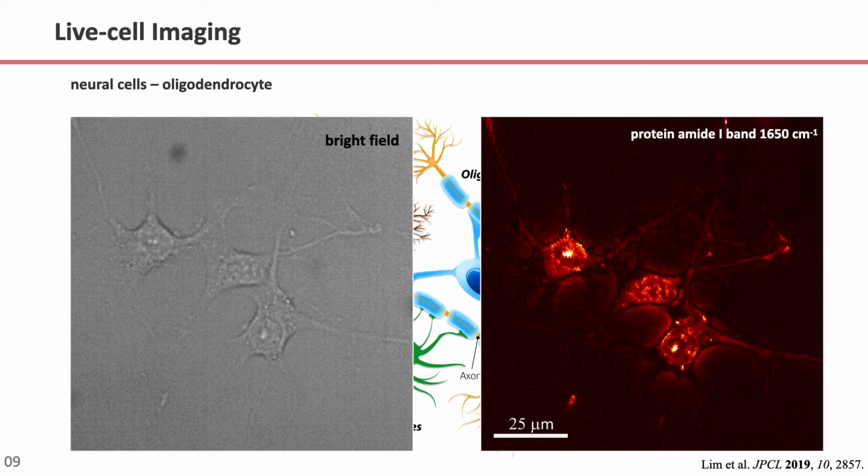In our photothermal measurement, we measure the photothermal contrast with 1650 wavenumber excitation for the protein amide band, showing signals are broadly distributed at the central regions of each cell. We also see that the strong signals might originate from the nucleolus.